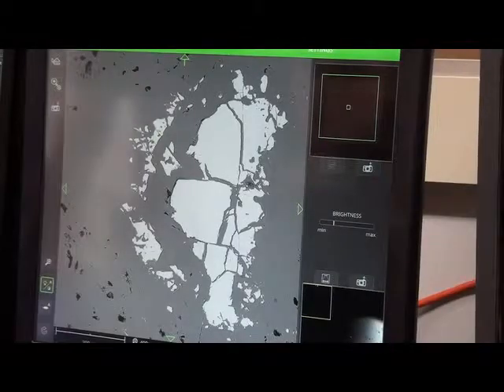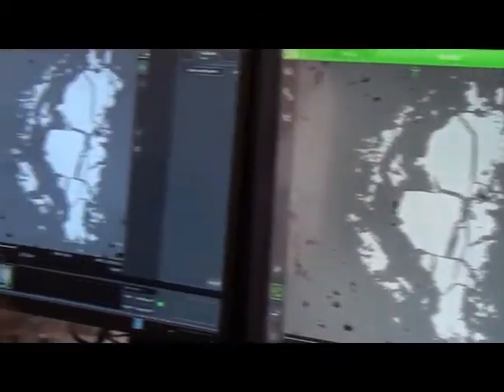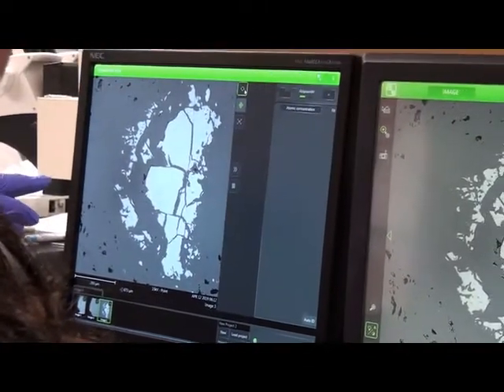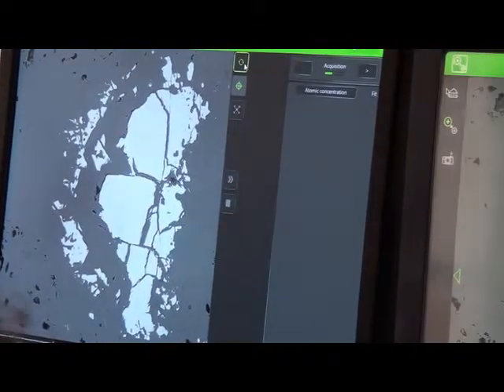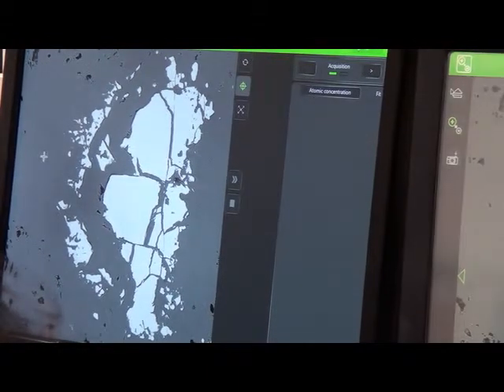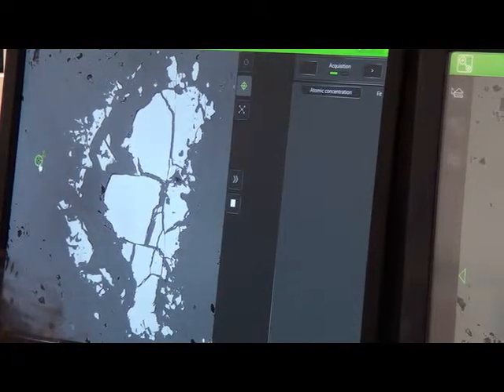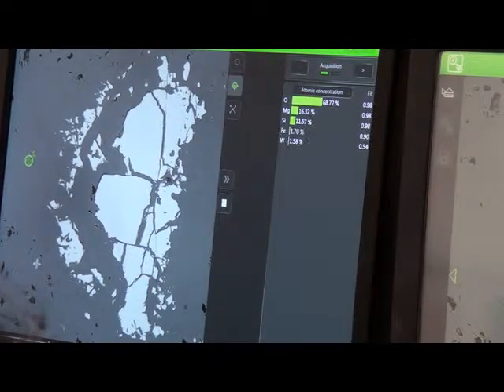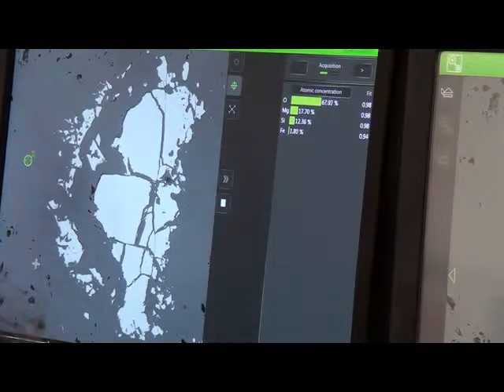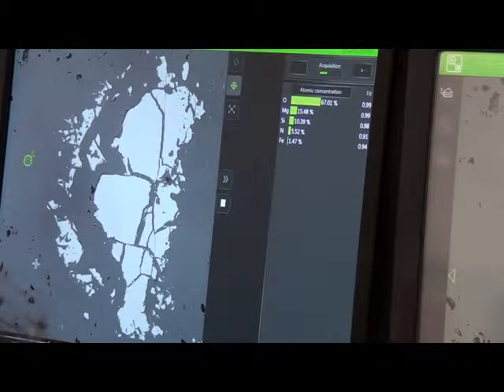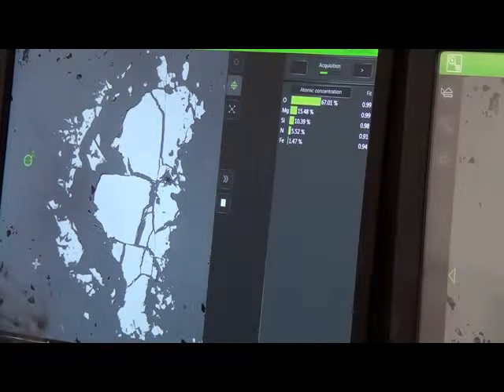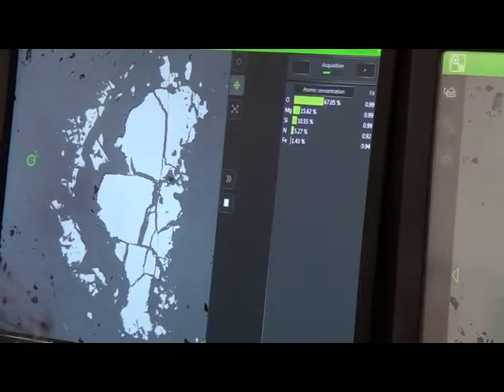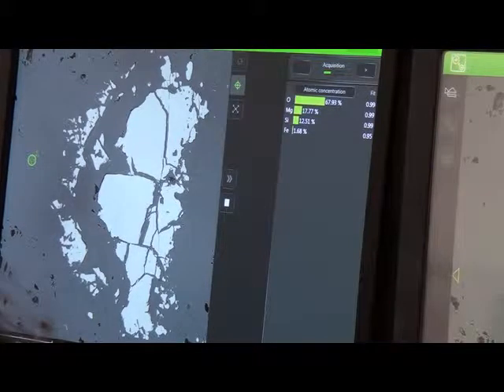So we've brought up the same image on this monitor now so that we can do a chemical analysis. If you could use this mouse, click out here in this darker gray field. We're looking at what's called a backscatter electron image. This is interesting because the atomic number of the material determines how much of the electrons get bounced back up to the detector.